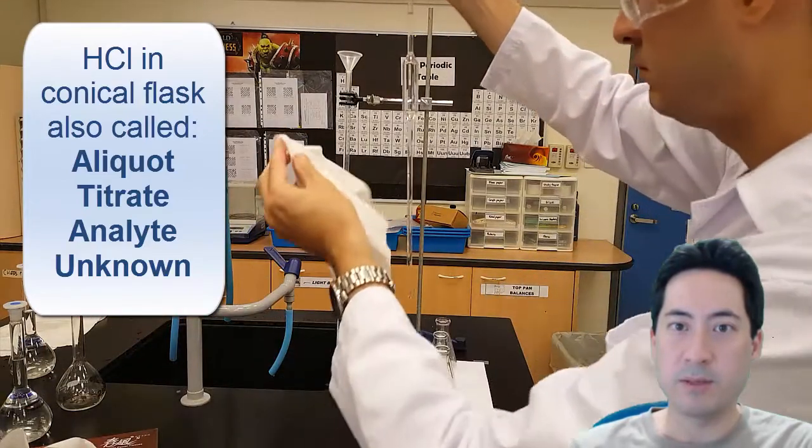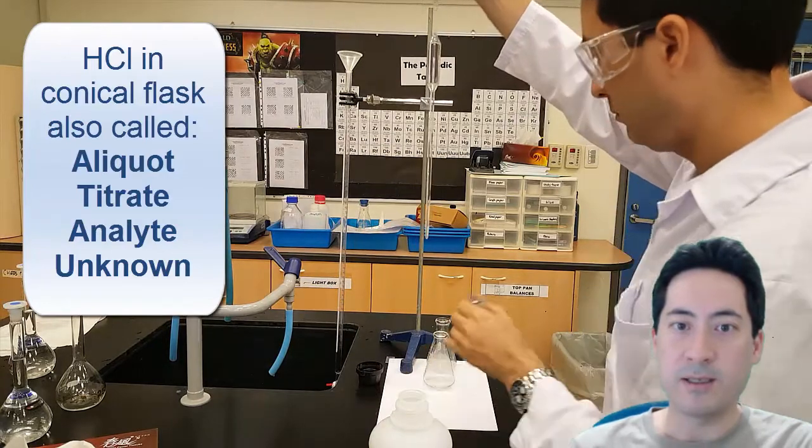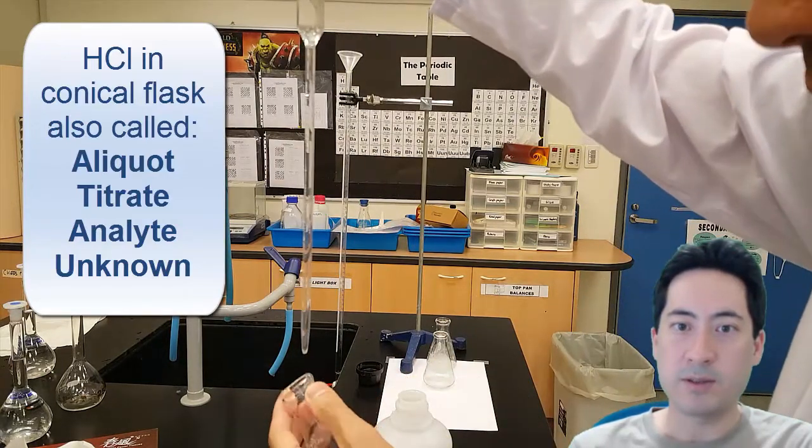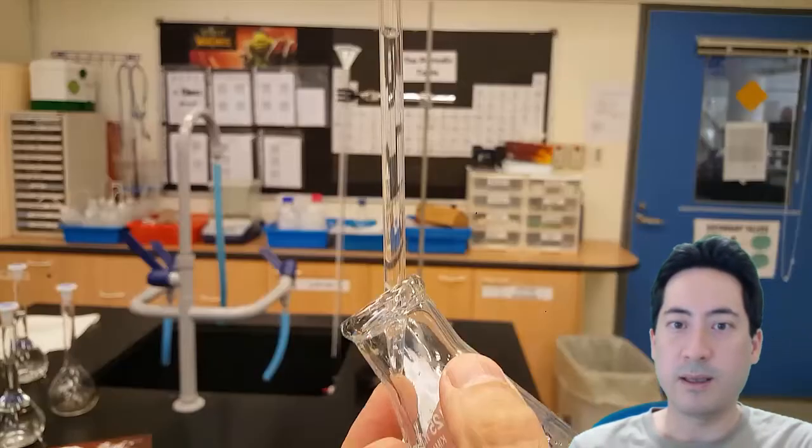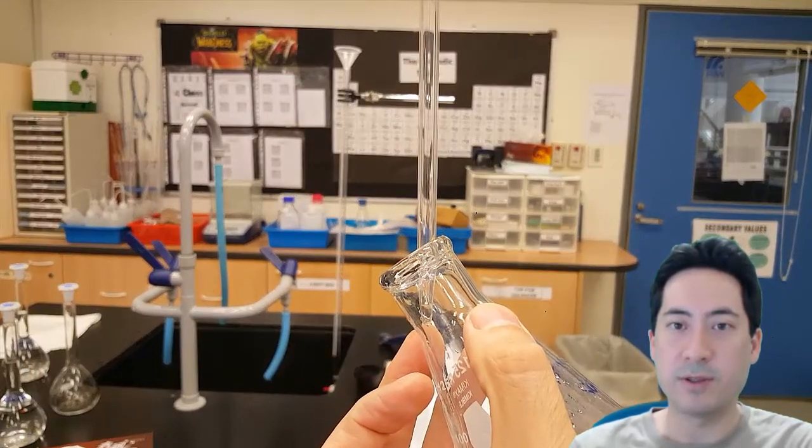Now to make sure no liquid drops down and I don't get more than what I want, I just get a tissue and wipe the sides of it. And as I release, I make sure that the whole thing is always vertical and I make sure the glass of the conical flask touches at a 45 degree angle.